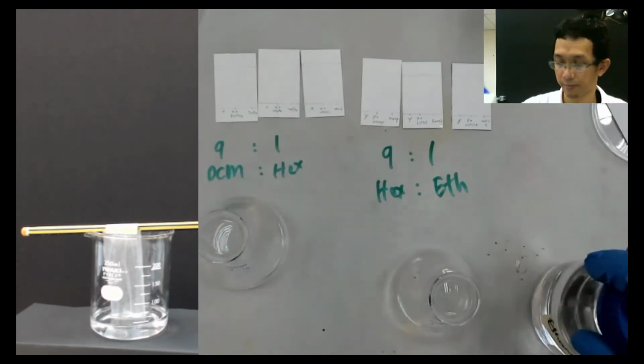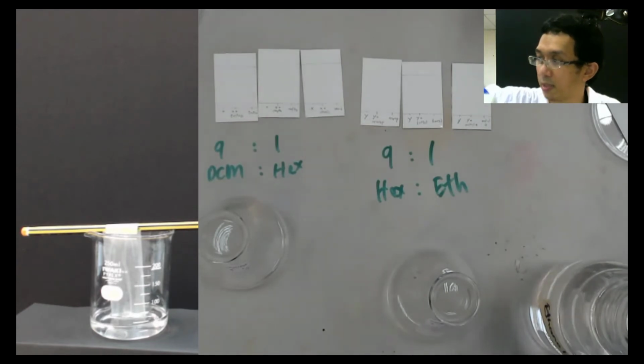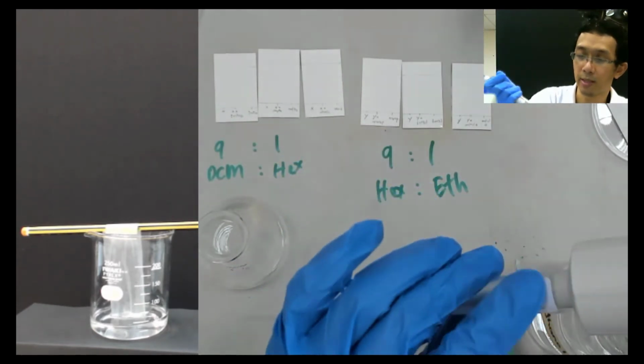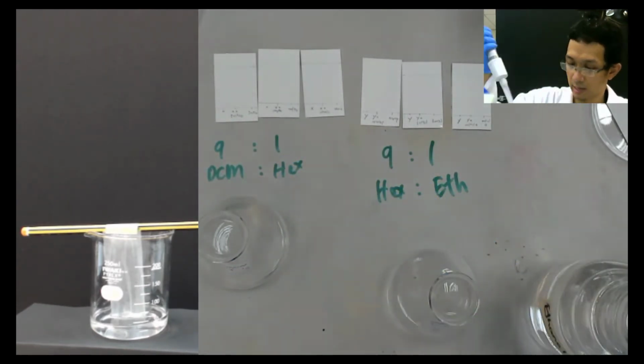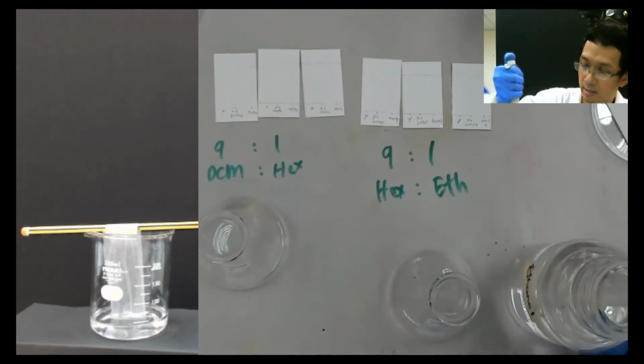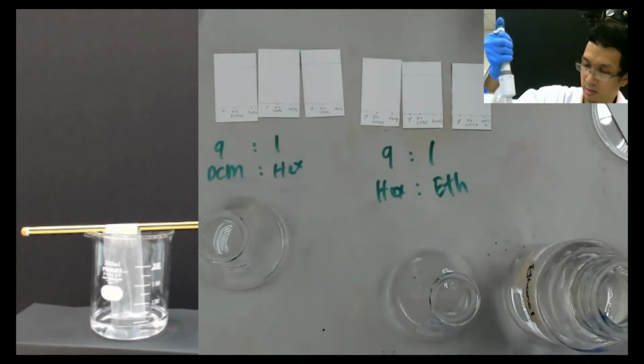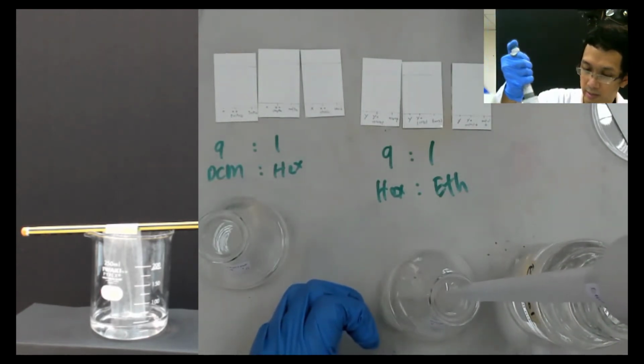So this ethanol. I open the ethanol and take the tip for ethanol. So I already prepared the tip for ethanol. And then I take some ethanol here. Let me take it. Okay, I put ethanol inside that.